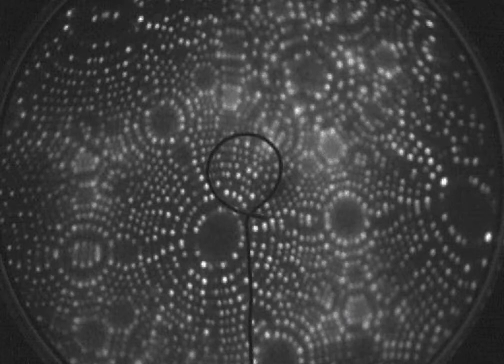And this is an image here showing a field ion micrograph of tungsten. So here you can see individual atoms of the first layer, the second layer, the third layer. This is a low index plane, pole. You can see symmetries here. And so you will evaporate this tip from the edges of planes, because here you've got the highest electric field.